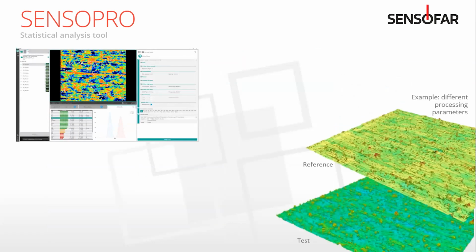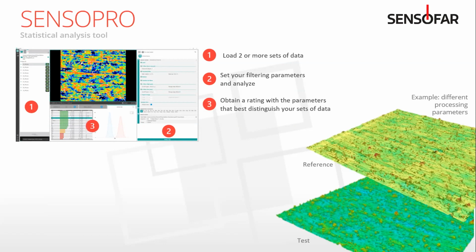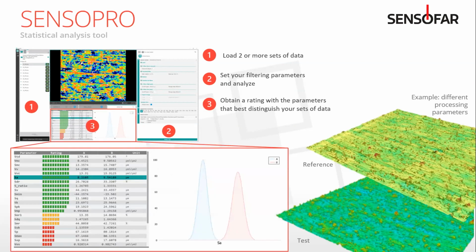In terms of how the workflow works, you can either load one set of data and just analyze that, or analyze multiple, maybe from different weeks or different months, and compare the sets of data, up to 6 sets of up to 1,000 files. So you'd set your filtering parameters, hit analyze, and then you'll get some sort of rating that looks like these curves down here.